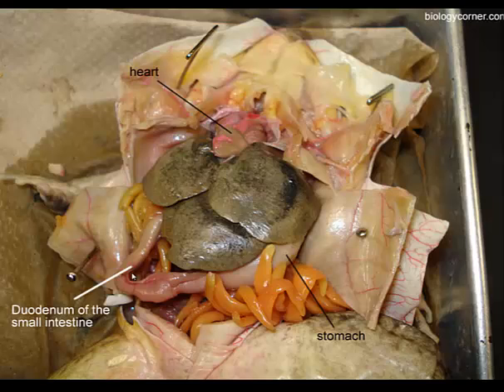The ileum is what you see when the small intestine is folded all over itself. It's held together by a membrane called the mesentery. When you look at the mesentery holding together the folds of the small intestines, make sure you notice the blood vessels — those are responsible for transporting nutrients away from the intestines.